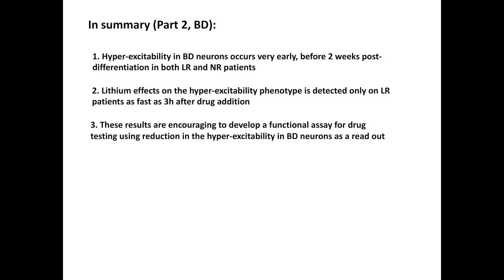In summary, in part two, we show that hyperexcitability in bipolar disorder patients occurs very early, before even 2 weeks post-differentiation, in both lithium-responsive and non-responsive patients. And lithium effects on the hyperexcitability phenotype are detected only in lithium-responsive cells as fast as 3 hours after drug addition. These results are encouraging for developing a functional assay for drug testing, using the reduction of the hyperexcitability that we've seen in bipolar neurons as a readout.